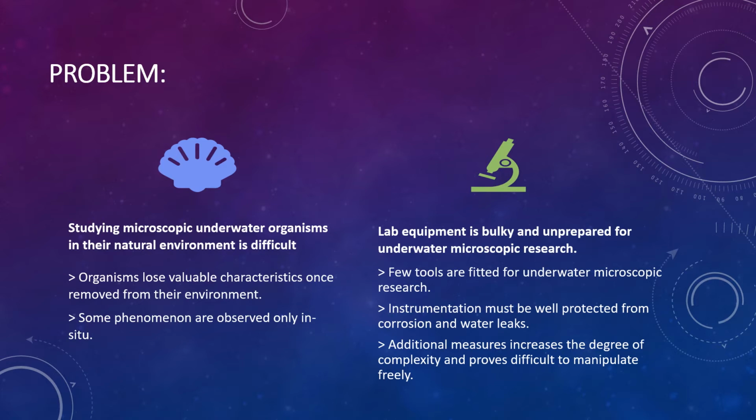Unfortunately, even though many existing laboratory instruments benefit the researcher in situ or in vitro, few work in the marine environment. Even if the instruments are waterproofed, they represent a cumbersome load on the marine research diver. To solve this, we propose MOSES.